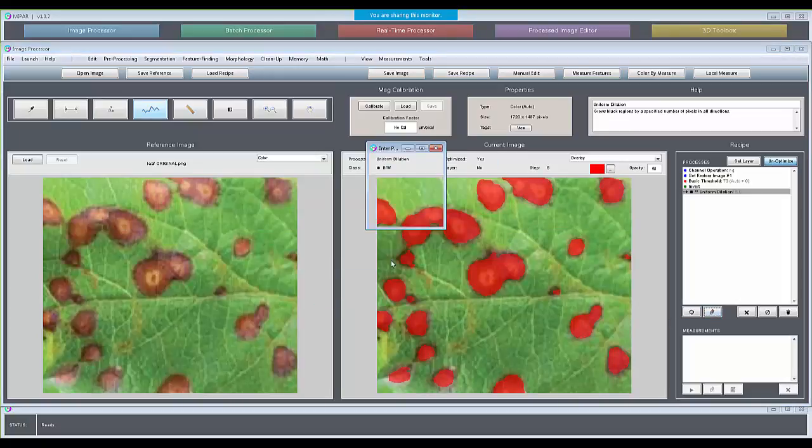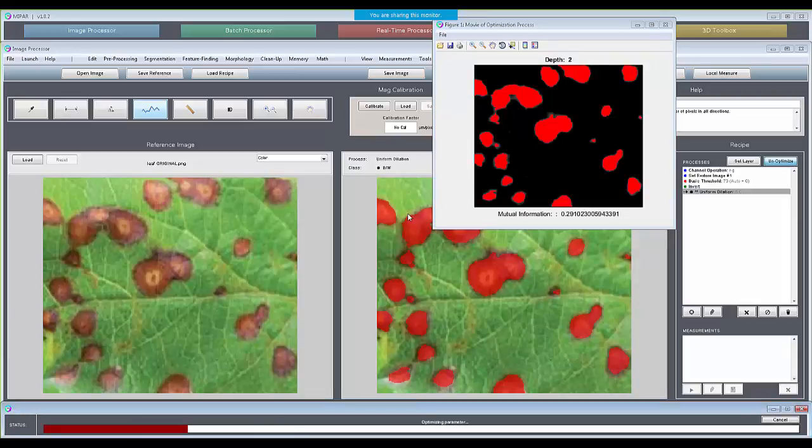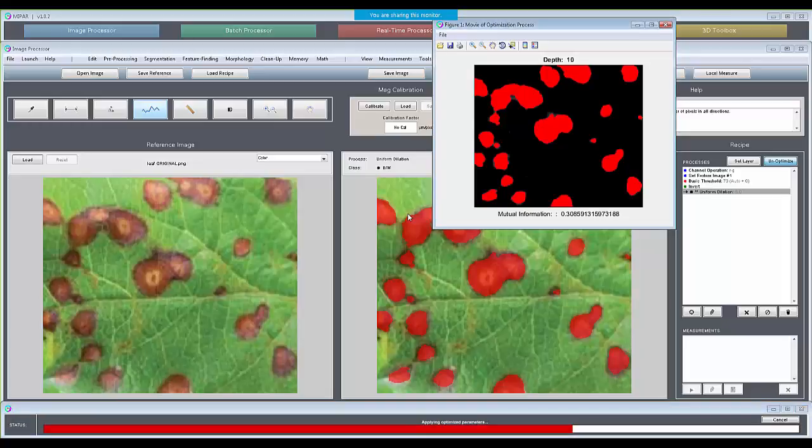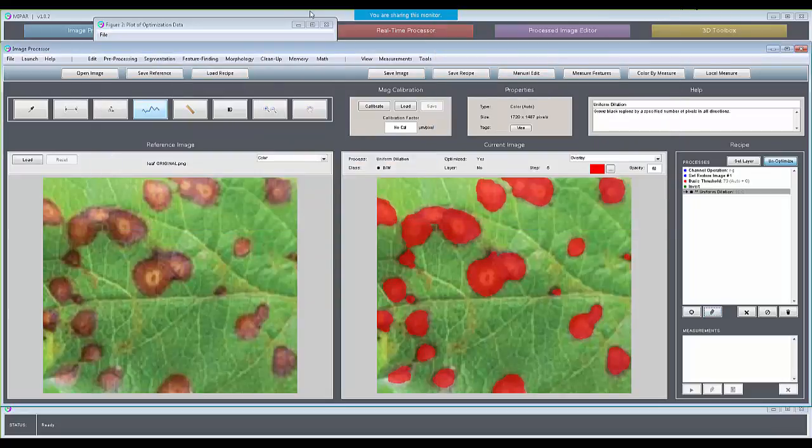So that might also be telling us that instead of trying to optimize the dilation at the end, we could optimize the threshold. I'm surprised that the auto threshold wound up being so much under the... Oh, that's really interesting. That keeps going. Yeah, let's optimize the threshold instead.